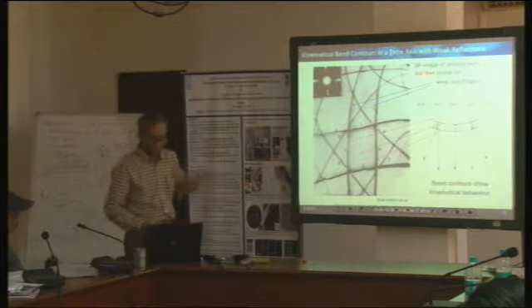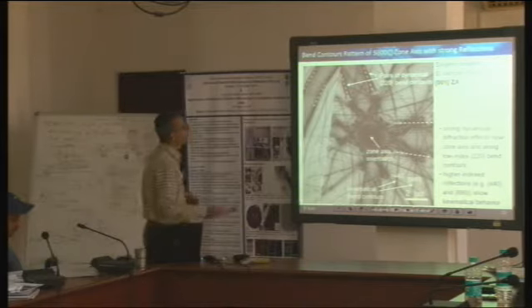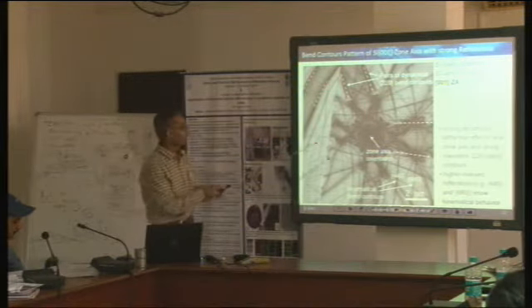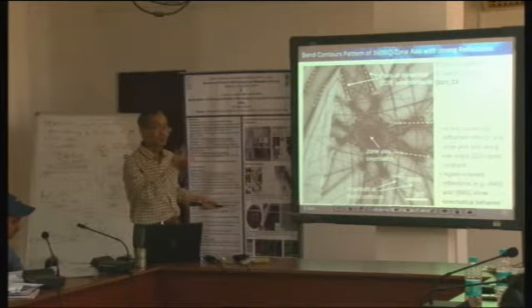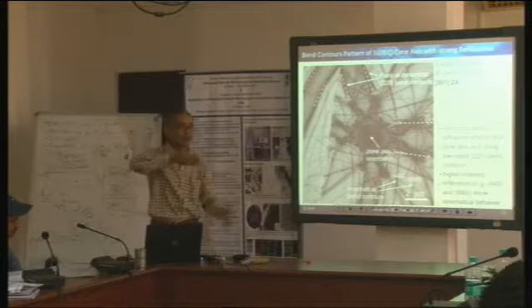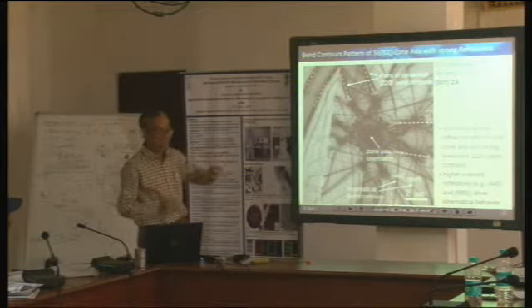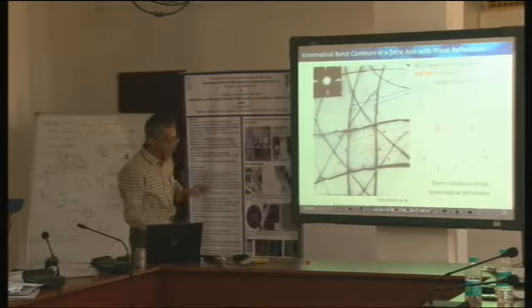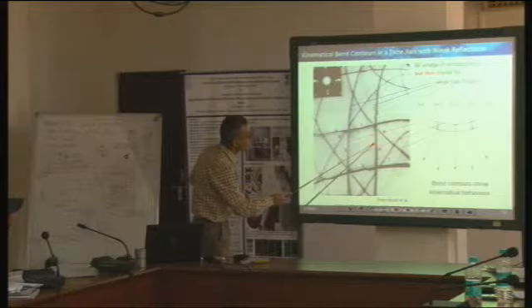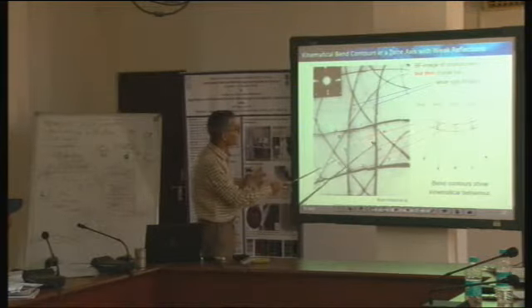But when you go to a thicker area of the sample, things get even more complicated. Your bend contours start to look like this. Now it is not anymore possible to say I have this dark fringe surrounded by side fringes, etc. Because here it was fairly clear: this must be my bend contour, here there is a secondary dark fringe, and on the other side also there must be a secondary dark fringe.